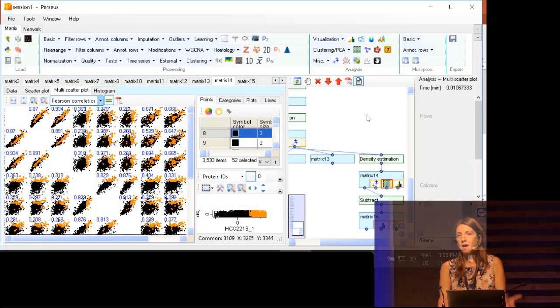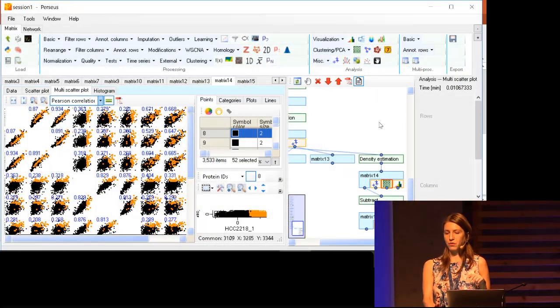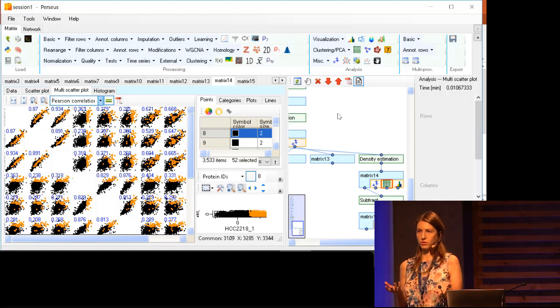And there was another question before that regarding the annotation files and how often those are updated. Probably not as often as you would want, so it's not every week or every month. But what you can actually do is, all these annotations come from UniProt, which is really an amazing resource for proteins.